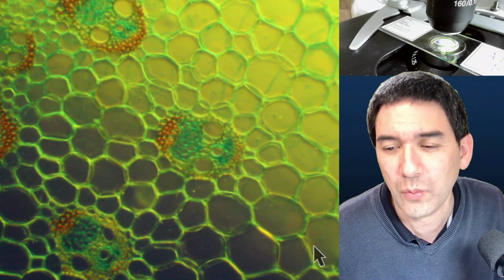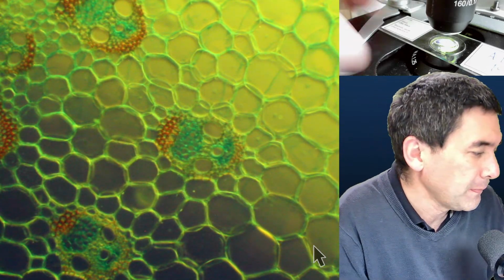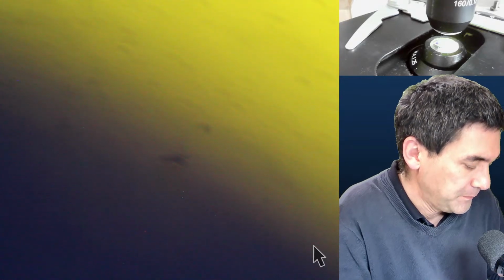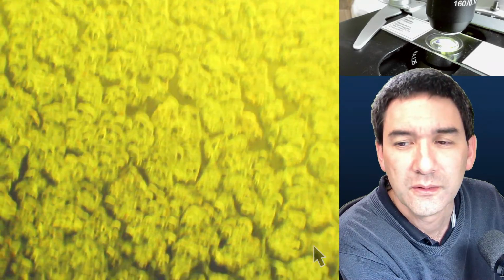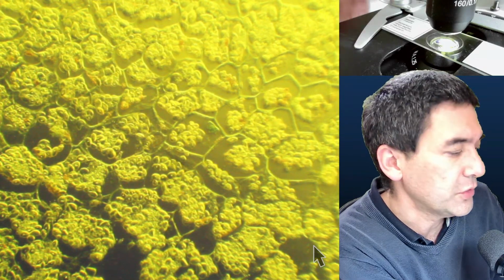So it's 1 hour 23 minutes, and I'm just going to show you the last one. That is now a cross section of a wheat grain, and there are starch grains visible. These tiny things that you see here are starch grains of a wheat.